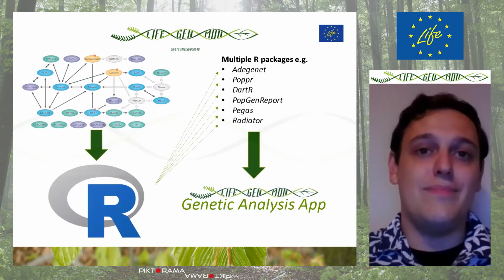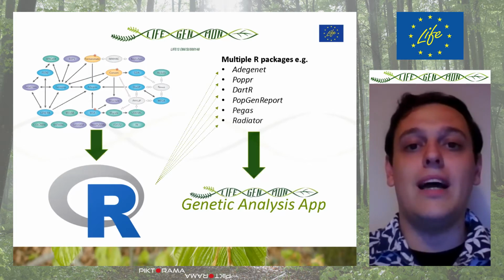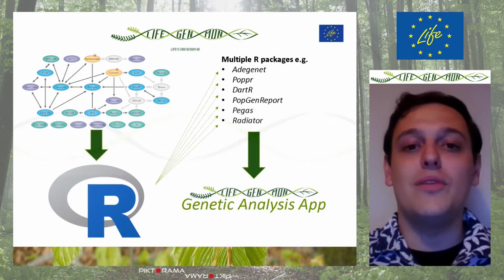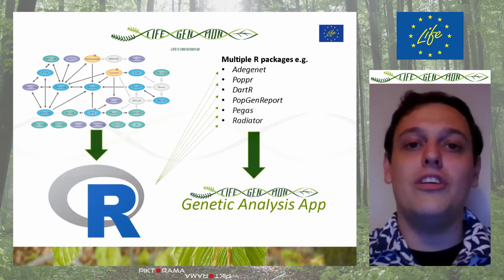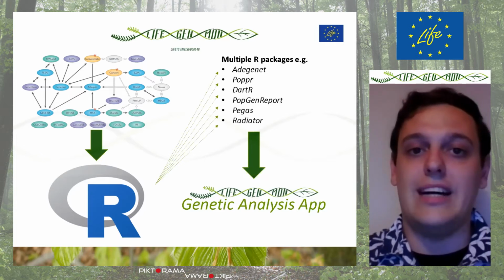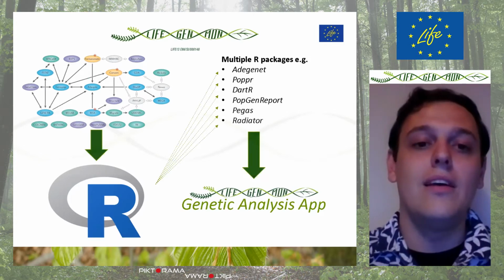So in recent years, many of the functions of these standalone programs have been able to either be complemented by or entirely re-implemented within the R environment. This can both speed up the analysis and, very importantly, create very well documented pipeline scripts which can be used to entirely reproduce the outputs of analysis or used as a jumping off point for further analyses.